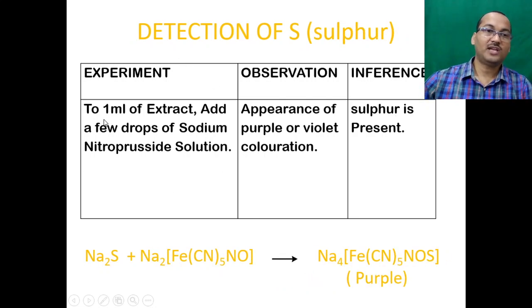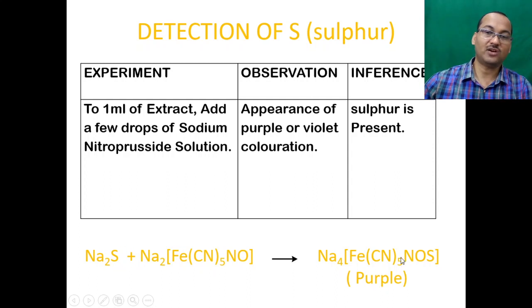Alternatively, take 1 ml of the Lassaigne extract and add a few drops of sodium nitroprusside solution (Na₂[Fe(CN)₅NO]). This reacts with sodium sulfide to give sodium thionitroprusside, which is purple or violet in color, confirming that sulfur is present.